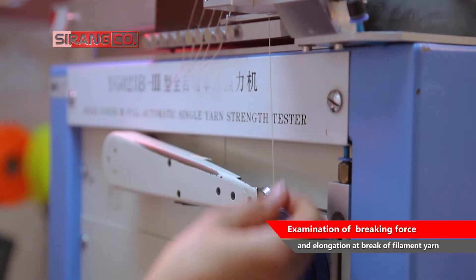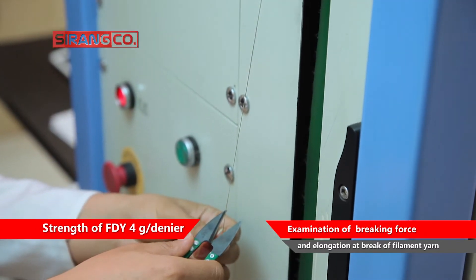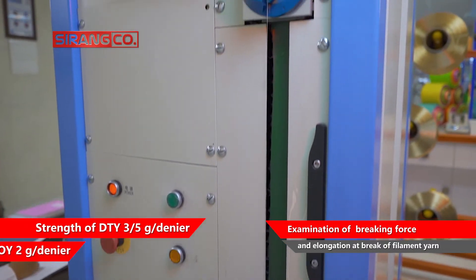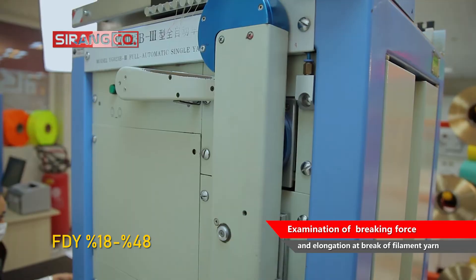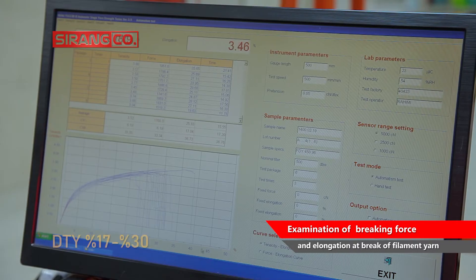It is noteworthy that according to the national standard of Iran, the strength of FDY, POY, and dope-dyed DTY yarn is at least 4, 2, and 3.5 g per denier respectively. The allowable range of FDY, POY, and DTY yarn elongation at break is 18 up to 48%, 100 up to 170%, and 17 up to 30% respectively.